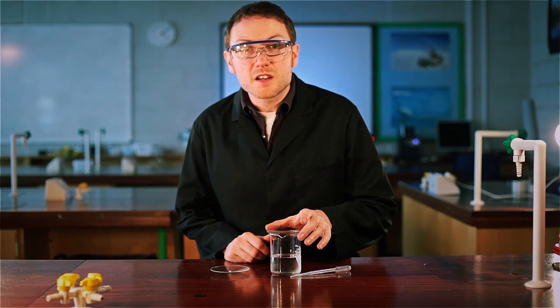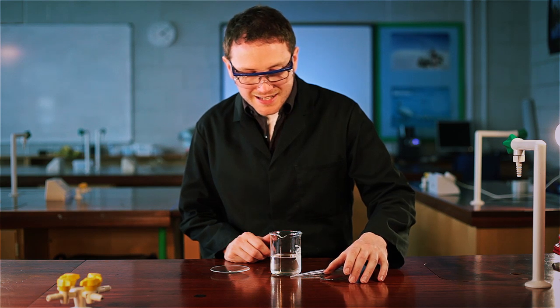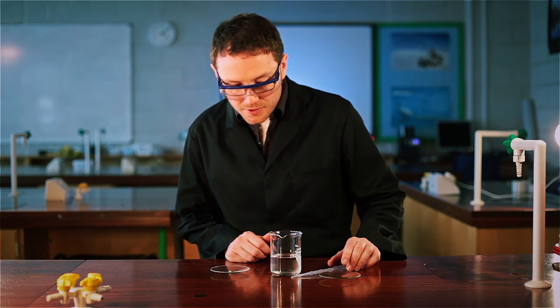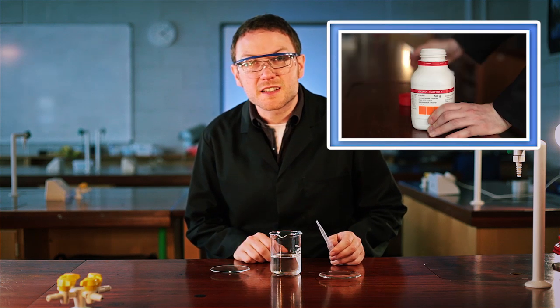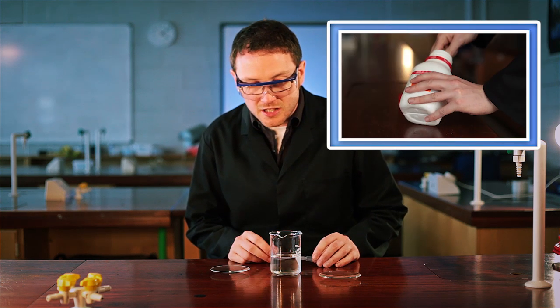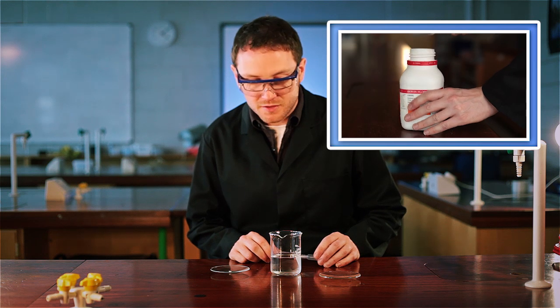So here's my original supersaturated solution of sodium acetate, or sodium ethanoate if you prefer. And I made this by getting 125 grams of the sodium acetate and then heating that gently over a Bunsen with 12.5 grams of water.